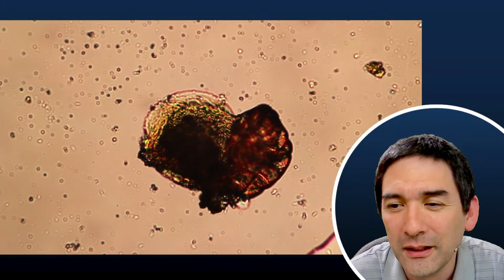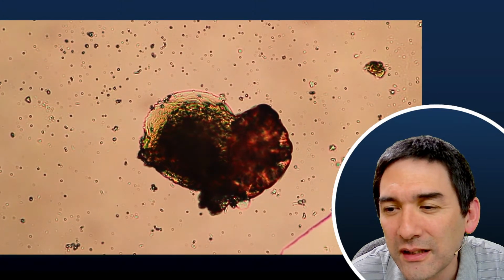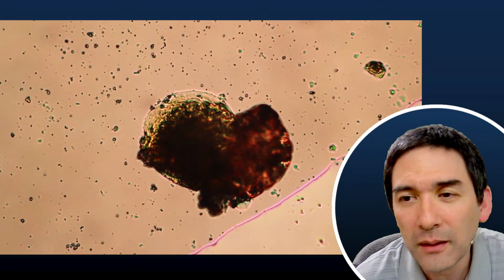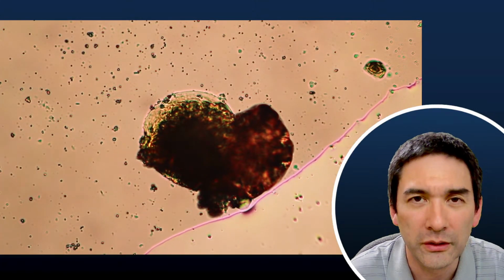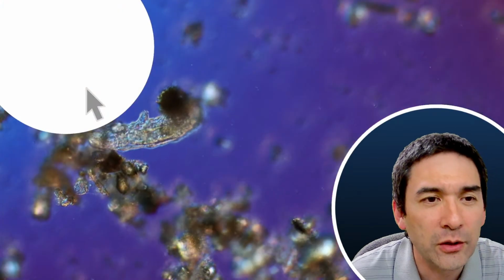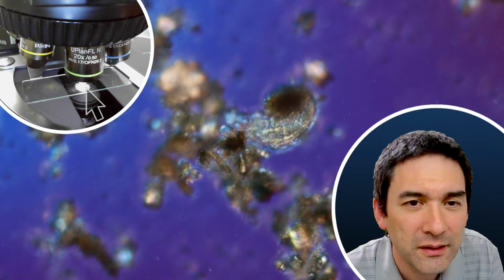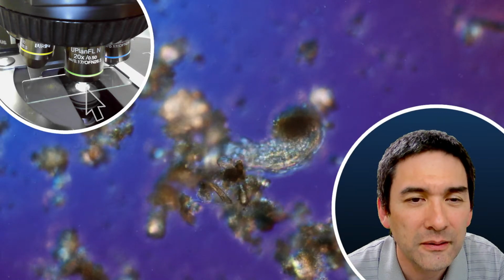I found a dead tardigrade a while back, and the two stylets had relaxed and were sticking out of the mouth. Very easy to see. I've also seen not only dead tardigrades, but they like to molt, so they shed their skin. And you may maybe also have seen some of the empty skin of some of the tardigrades.